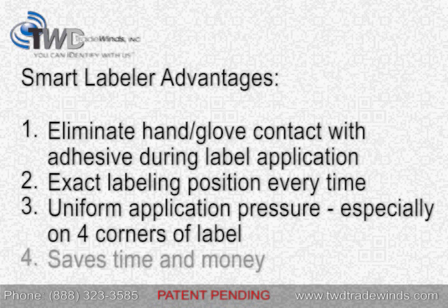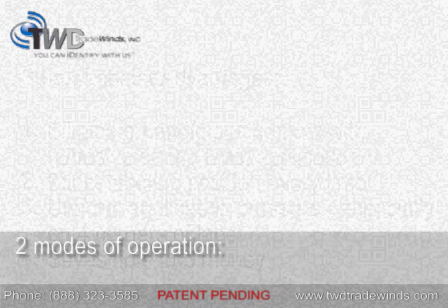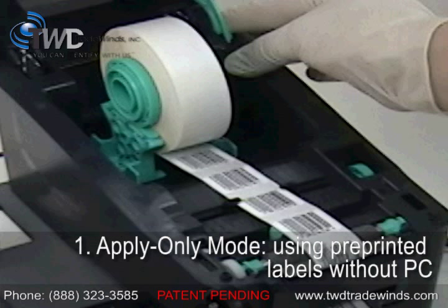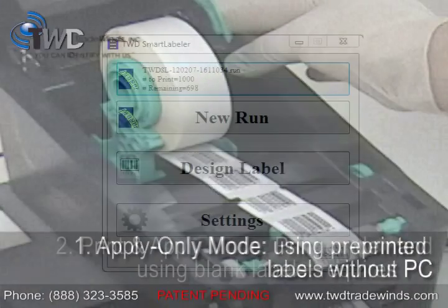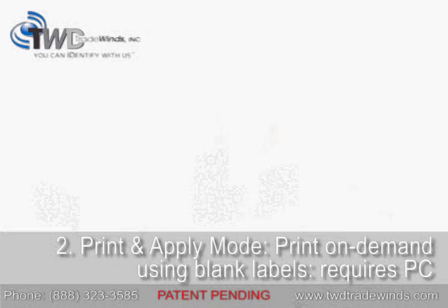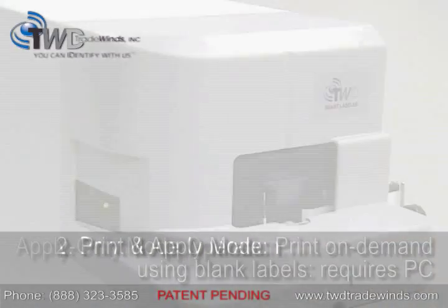Due to its speed and ease of use, the Smart Labeler is a great candidate for saving your laboratory both time and money. There are two modes of operation. You can either use pre-printed labels in apply only mode in order to get quick and uniform label application without a PC, or you can use print and apply mode with your PC to get custom labels on demand.